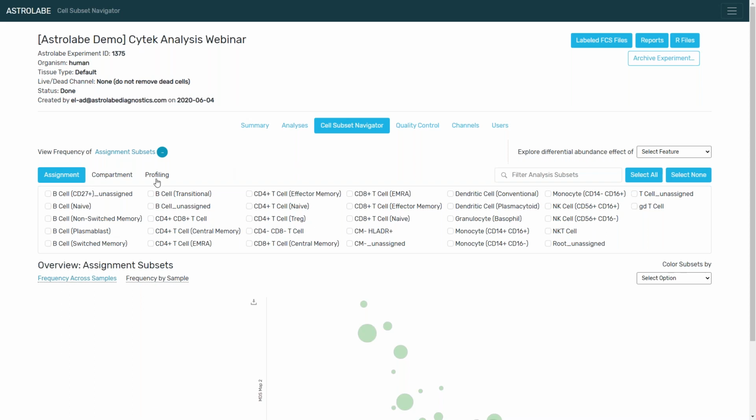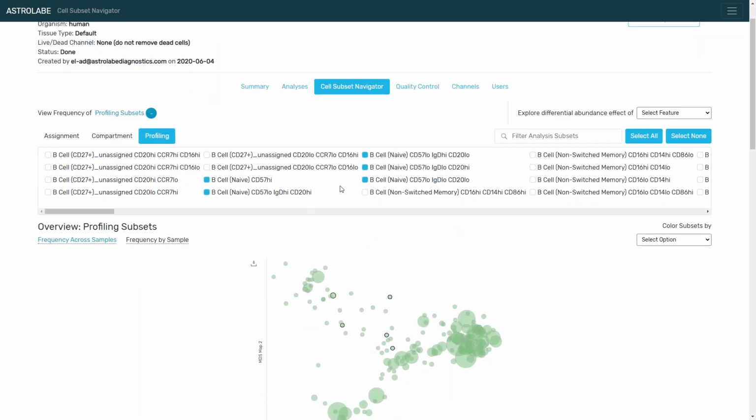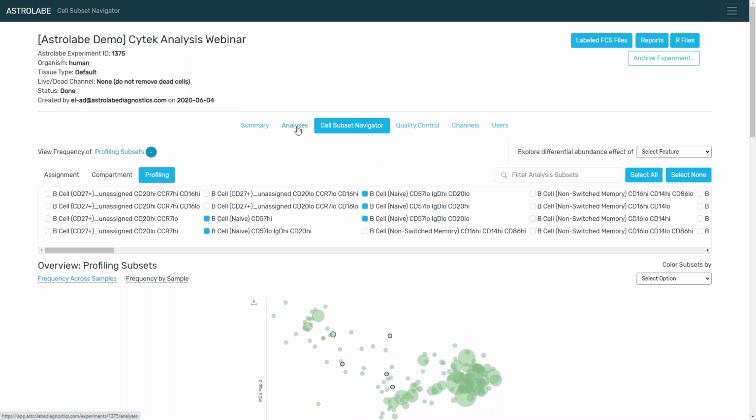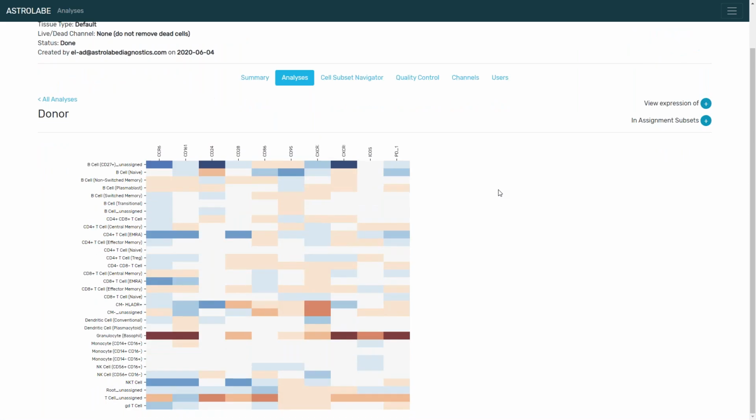And the same way that we've used this mechanism to delineate the possible role of IgD in the naive B cells, this will be relevant for any other marker. The second tool is this differential expression analysis tool. And here you can explicitly state, here are the markers I find relevant. Here are the markers I'm curious about. Please tell me how they diverge across the different experimental conditions.